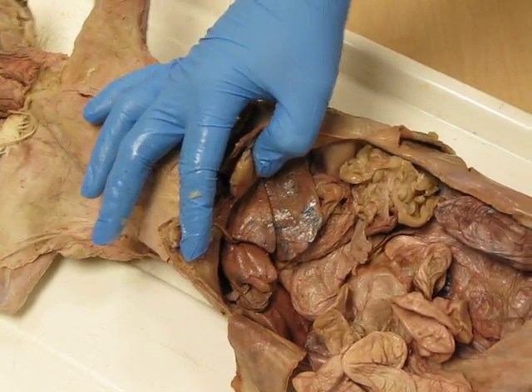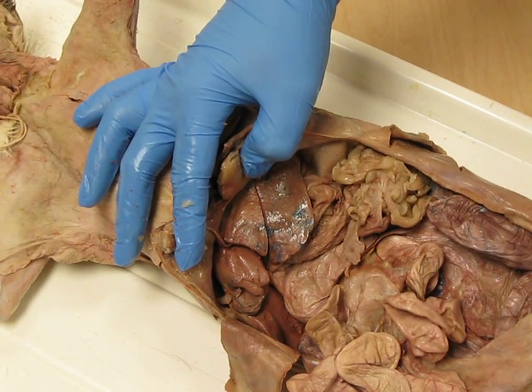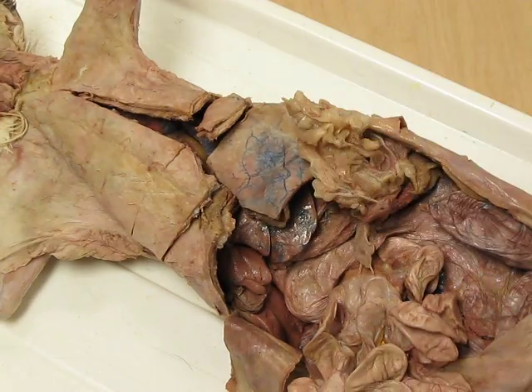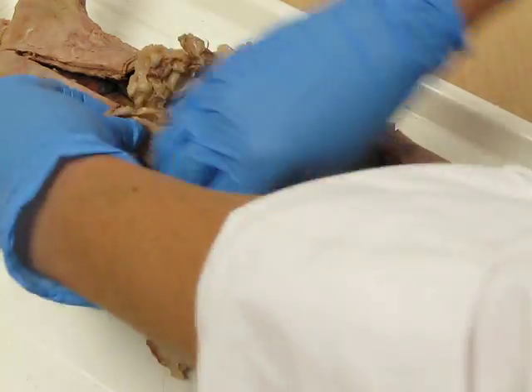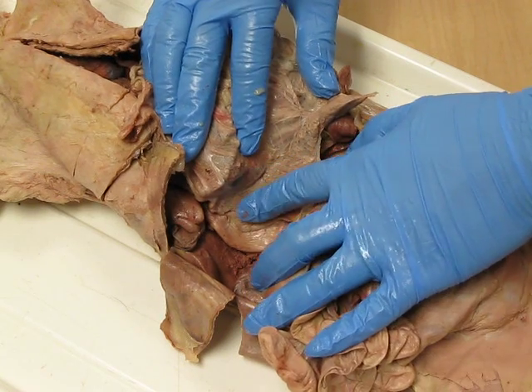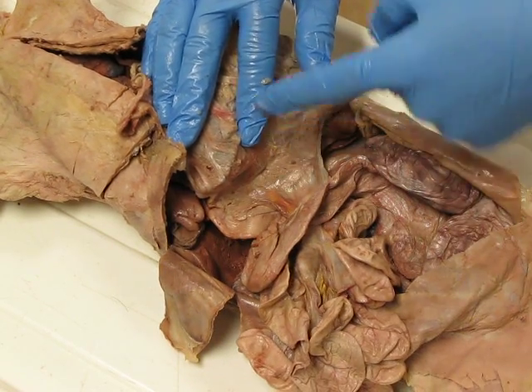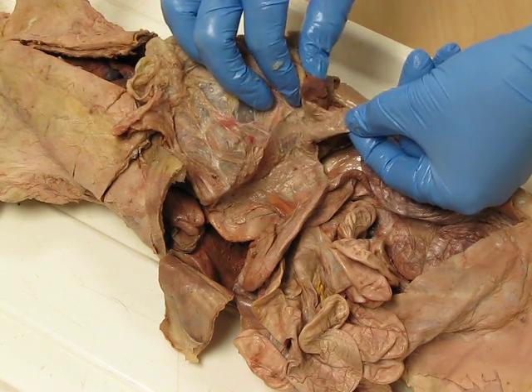Okay, and then we have the pancreas. So we did the pancreas in another video, but here we go again. You just lift up the greater omentum and look underneath the stomach. Okay, so what we've got is the head of the pancreas around the duodenum, body of the pancreas underneath the stomach, tail of the pancreas right next to the spleen.